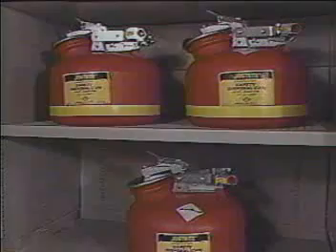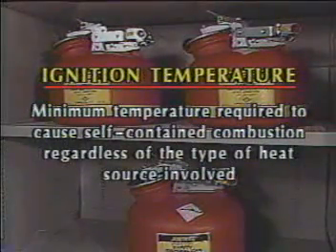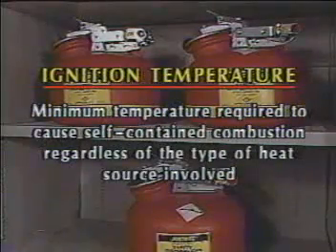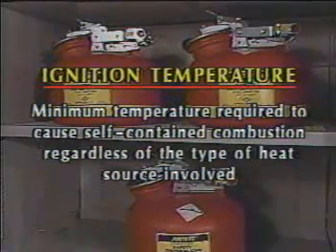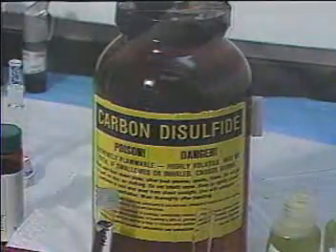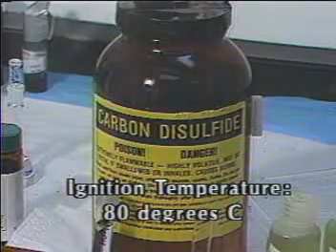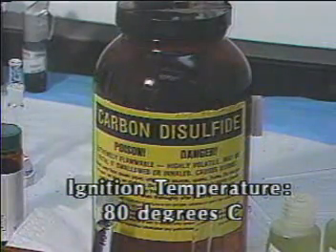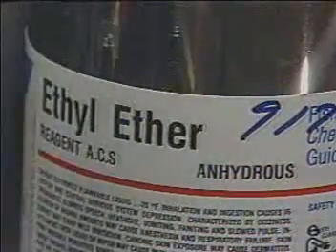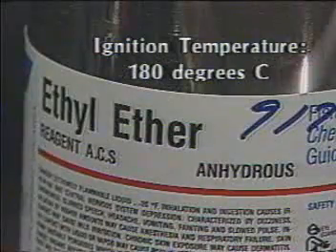All flammables also possess what is called an ignition temperature. This is the minimum temperature required to cause self-contained combustion, regardless of the type of heat source involved. Carbon disulfide, for instance, has an ignition temperature of 80 degrees centigrade. Because of this, it can easily ignite through a nearby light bulb or steam line. Similarly, the surface temperature of a hot plate will ignite diethyl ether.